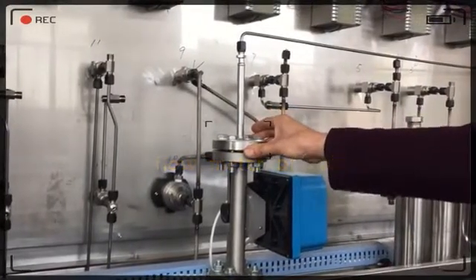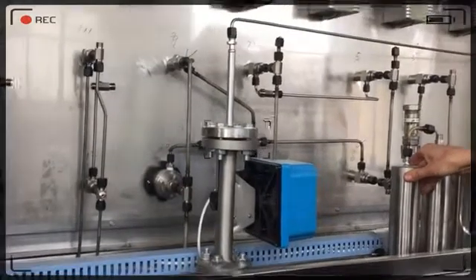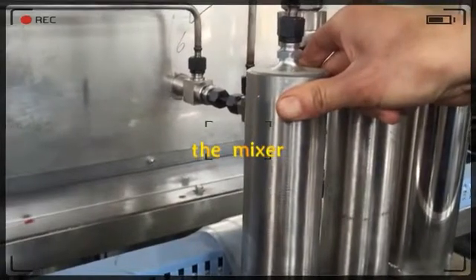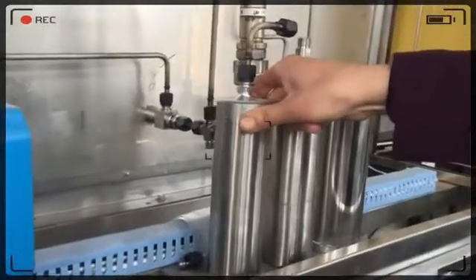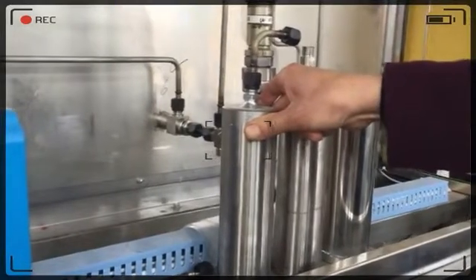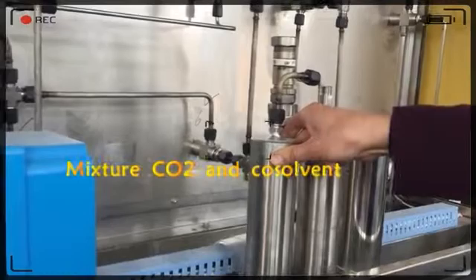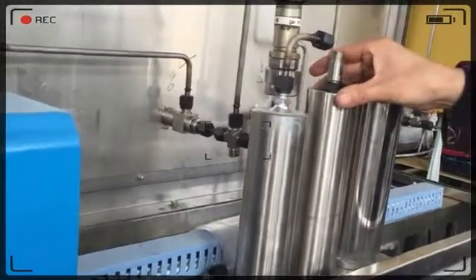This can measure the speed of the signal flow. This is the mixer. When they hit the system, it can wait for some time for the temperature to go up. It can mix the CO2 together with the solvent.